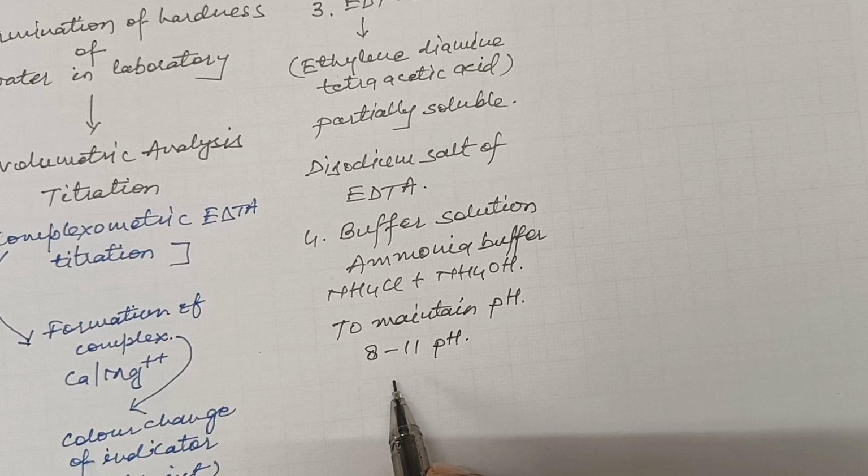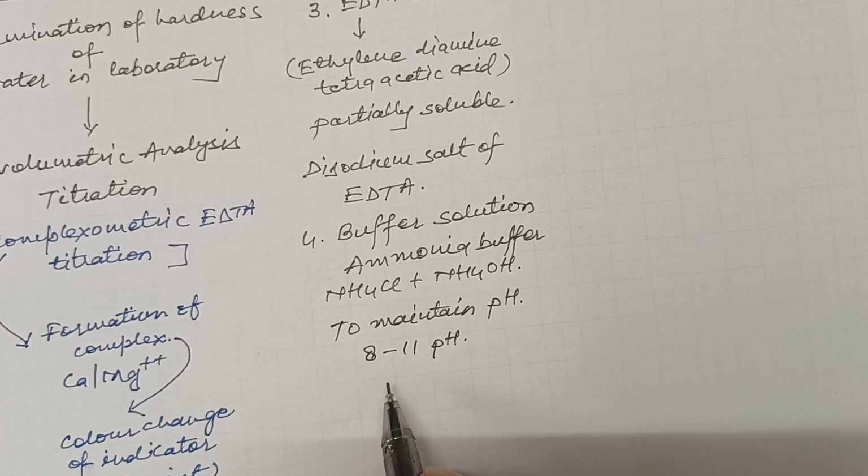This pH is needed because in the absence of this pH, the indicator doesn't work.